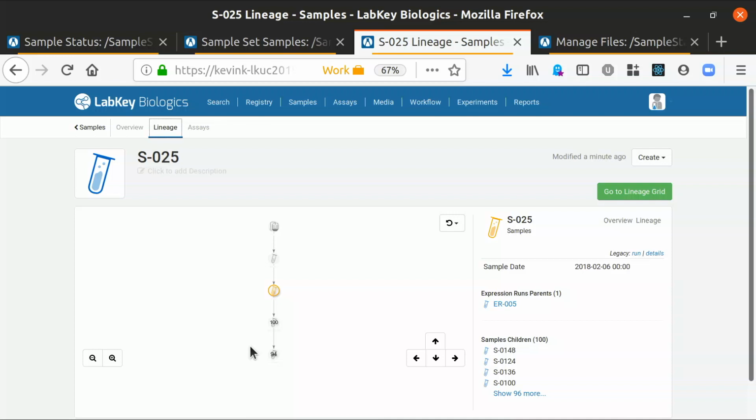You can make a cycle. I don't recommend that. The Lineage APIs protect against that. So the question is, if this is a directed acyclic graph, can I make a cycle? Yes, you can. Typically in practice that doesn't happen, but the Lineage viewer and the Lineage APIs will detect the cycle and stop recursing.